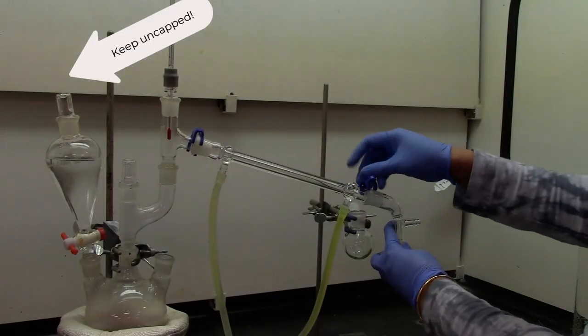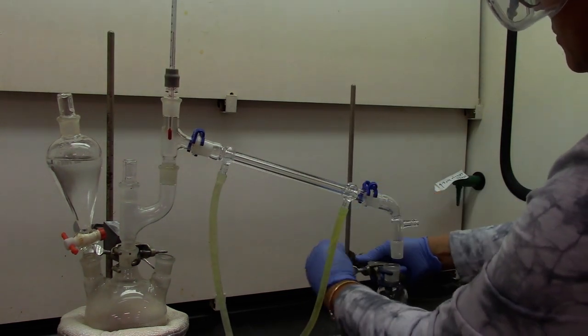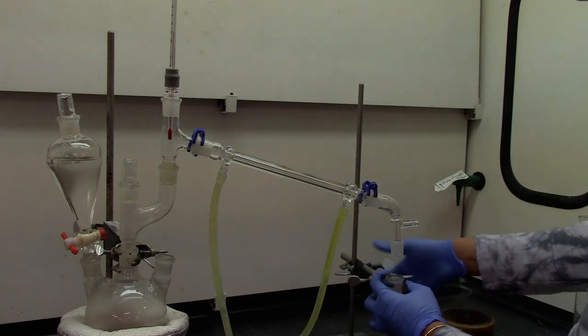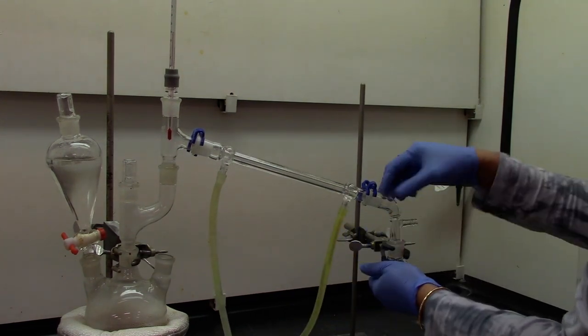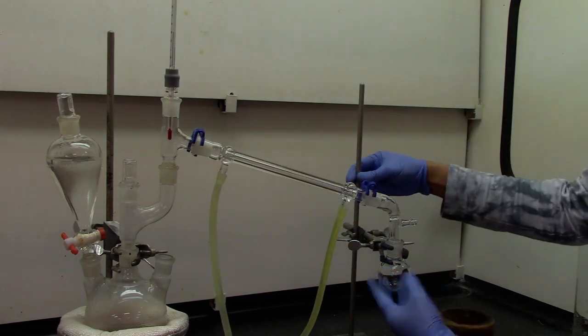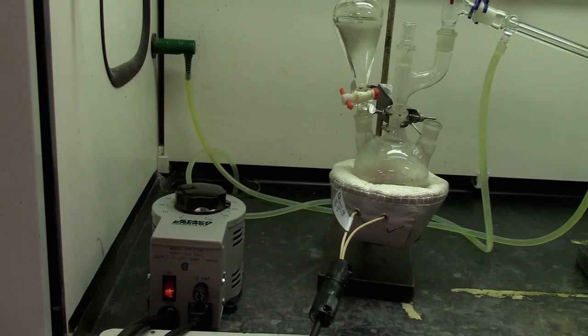Add the west condenser with keg clamps and a vacuum adapter at the end of the west condenser and the collection flask at the end of the vacuum adapter. Go ahead and turn on the heat and wait for the distillation to start.